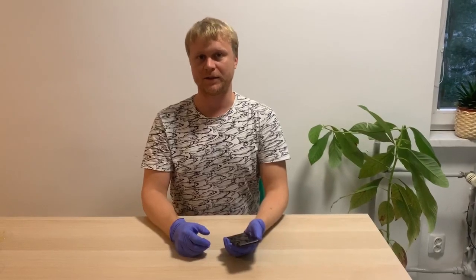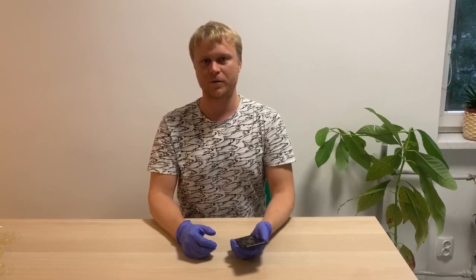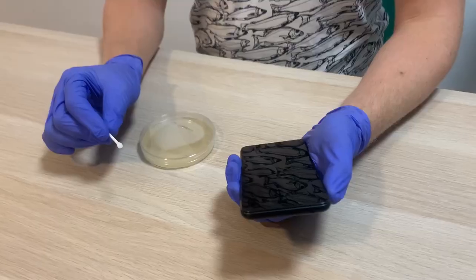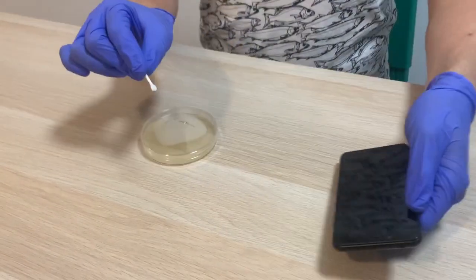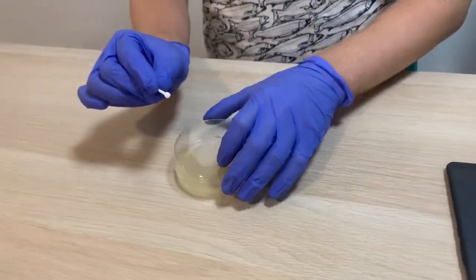We wash our hands, we clean our flat, but almost never do we clean our phone. However, we touch it more than 100 times per day. Take a cotton swab, make it wet, and swipe the screen of the phone. Next, transfer the bacteria in the same manner to the agar plate.